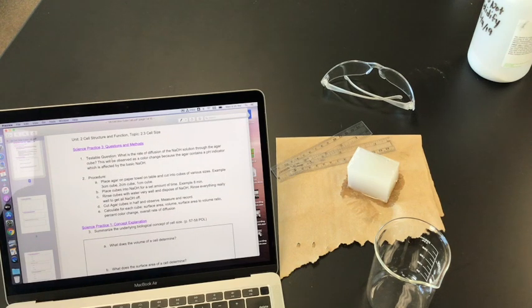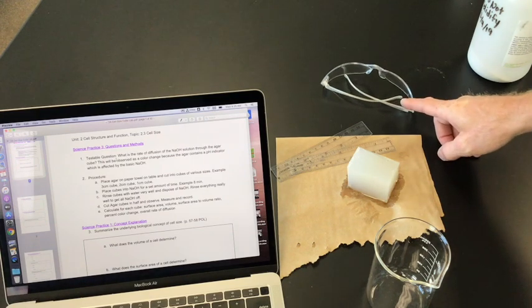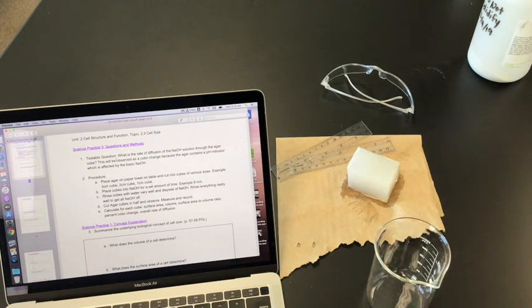So testable question in AP biology: we're going to look at what is the rate of diffusion of the NaOH, which is sodium hydroxide, which is a basic solution. We will wear goggles for this lab because of the chemicals we're using, even though the solution is going to be very weak.